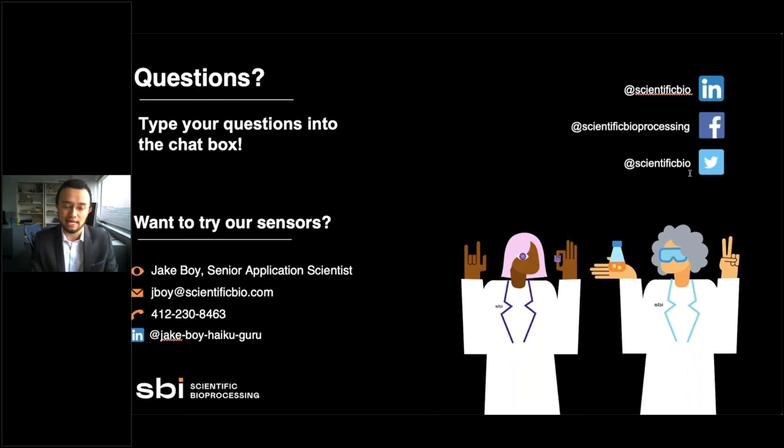But I can tell that some of the best results that I've seen of oxygen manipulation in these chips are from chips that use materials like polycarbonate or acrylic in order to make sure that the system is isolated from external oxygen, basically. These are chips that are supposed to be anoxic and that are being operated outside of an anaerobic chamber. And so in that case, it's very useful to carefully consider the materials that you expect to use for your chip before you embark on this long journey of trying to control oxygen in one of these systems.